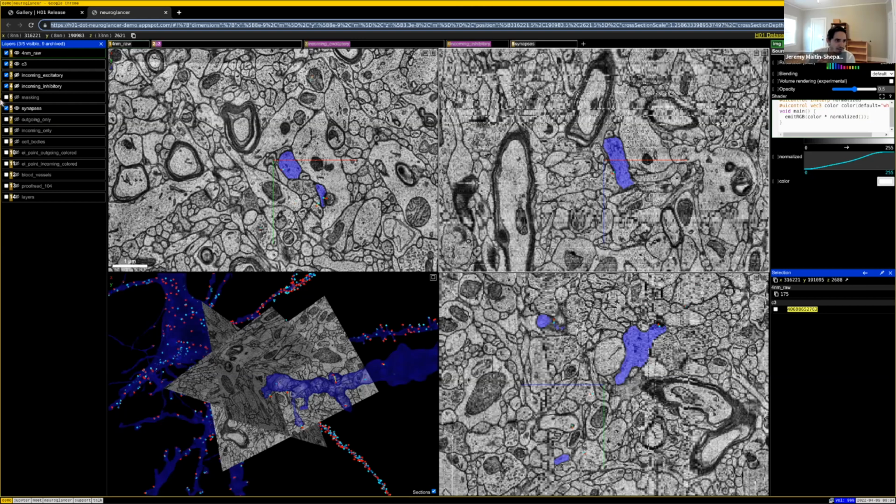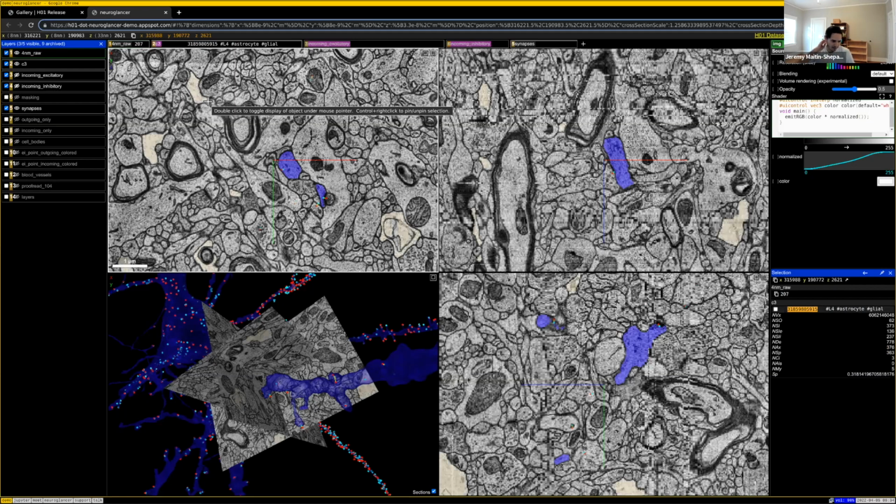So in this case, I'm loading this application from a server, but that server is just providing the HTML and JavaScript. There's no server-side API required to use NeuroGlancer. NeuroGlancer will just retrieve data sources in various formats from existing web servers or cloud storage directly. I'll just give a brief demo of NeuroGlancer. I imagine many in the audience are already familiar with it.